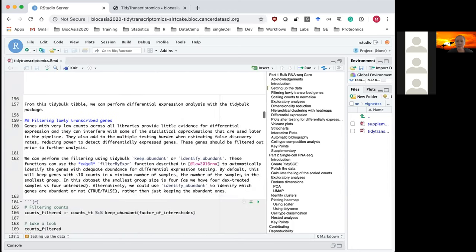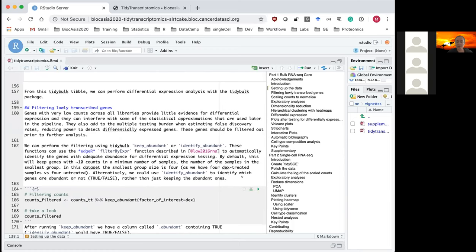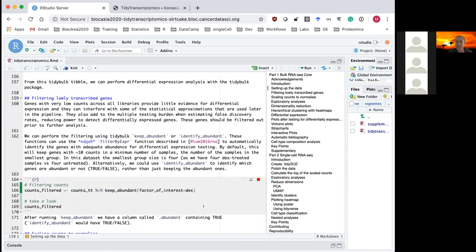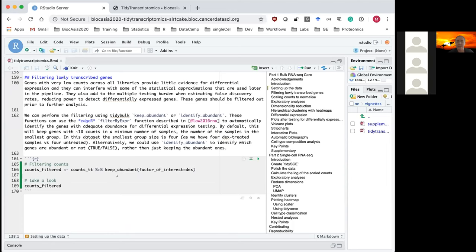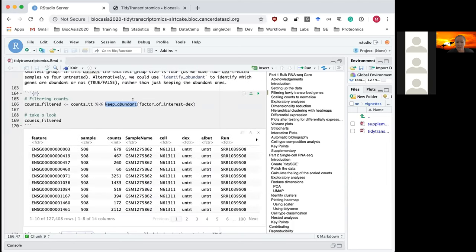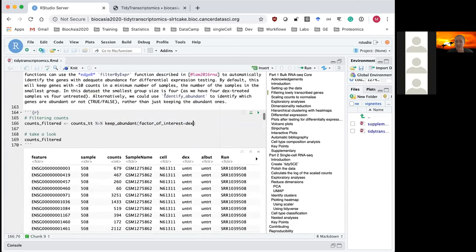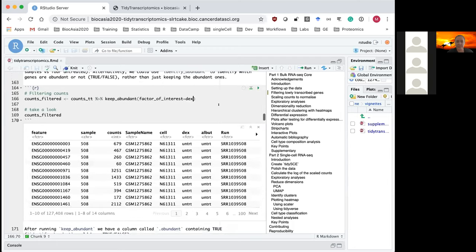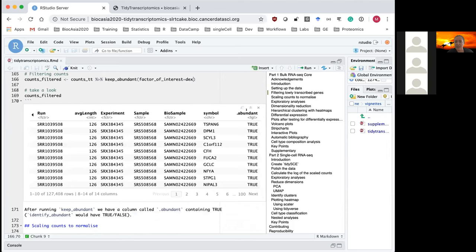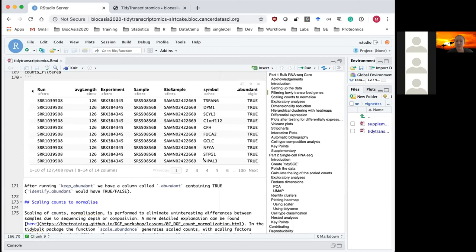One of the first steps in RNA sequencing analysis is to remove genes that don't have adequate expression for statistical testing. tidybulk provides a function called keep_abundant that automatically decides which genes have enough expression to be used — you just give it the column containing your group information, and it adds a column called 'abundant' identifying which genes have enough expression for testing.